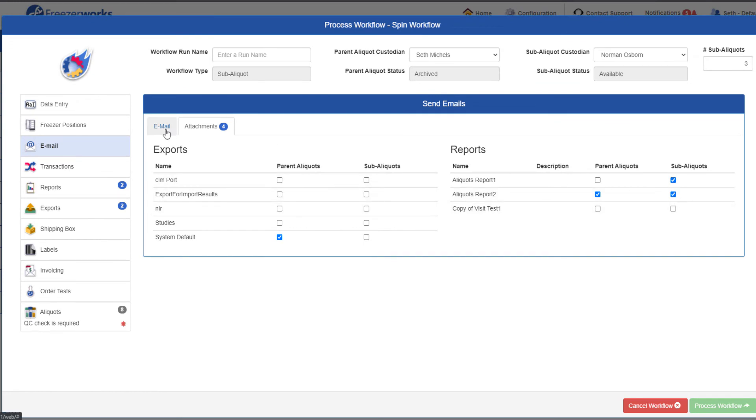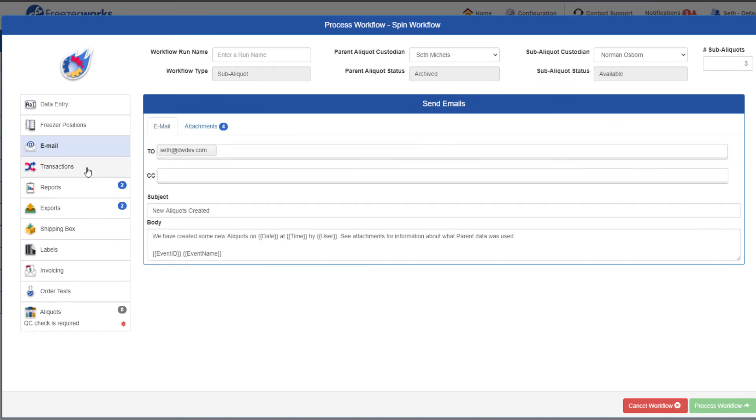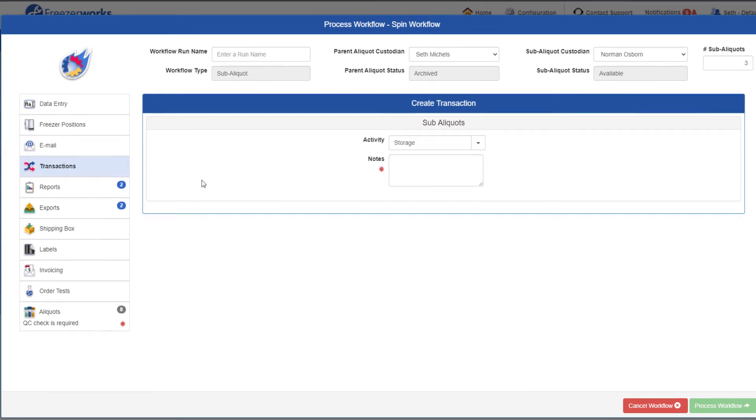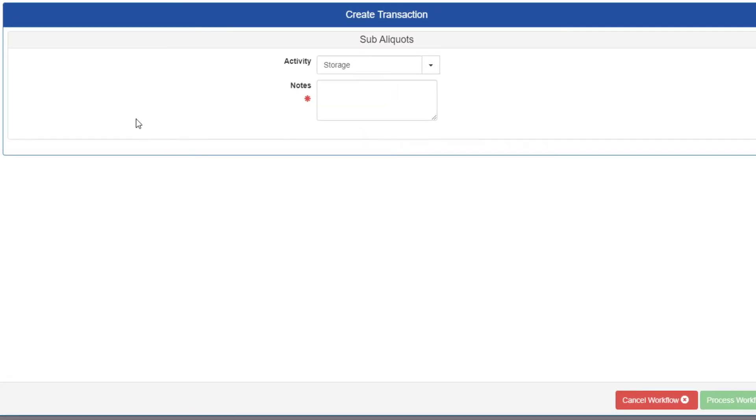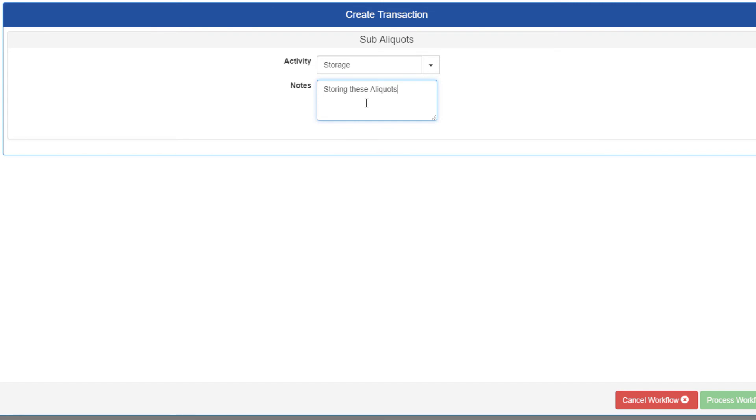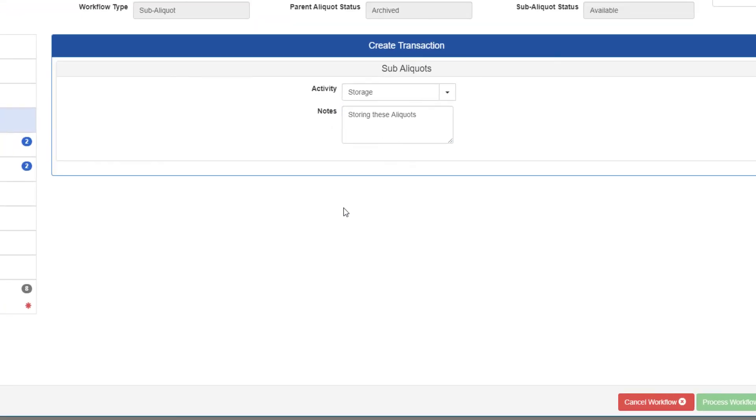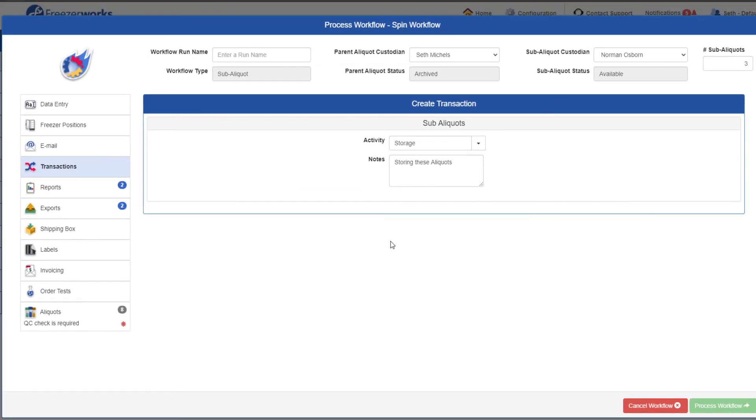For transactions, we don't actually get two entry areas like you would assume, because the configuration of this workflow did not leave the parent transactions modifiable, just the sub-aliquots. This, or the inverse, may be the case for you as you process sub-aliquot workflows, so just be aware. Fill out the sub-aliquot transaction notes, and the required task is complete.